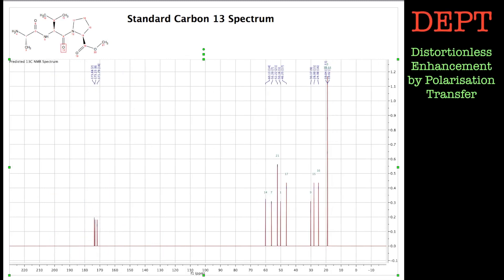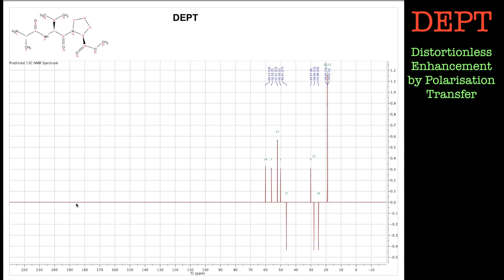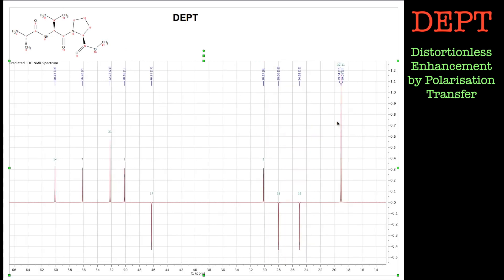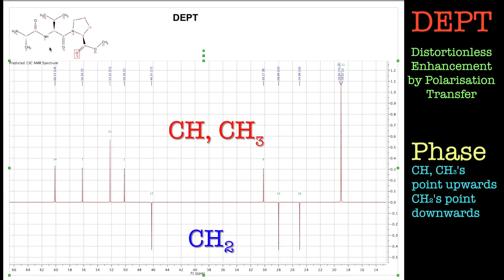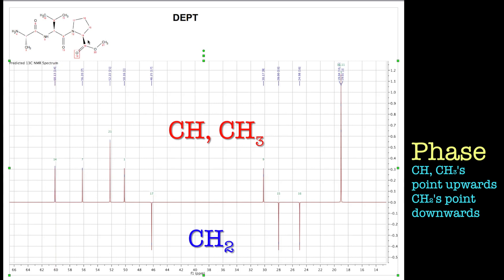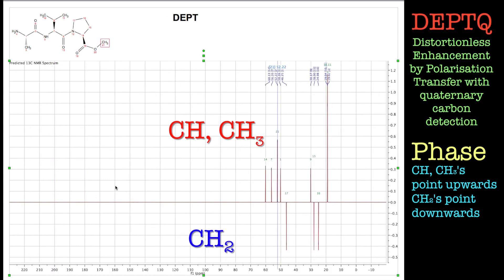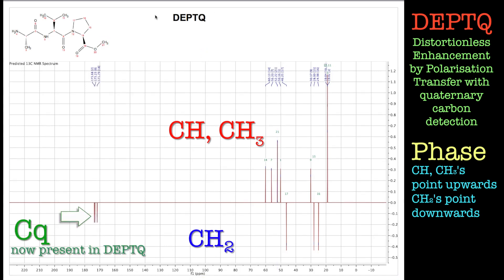DEPT is shown here - it's Distortionless Enhancement by Polarization Transfer. Basically anything attached to a proton will get transferred to the carbon, enhanced, and you'll see it. It looks at the coupling constant between carbon and hydrogen, and in doing that you can add phase to the final spectrum. So the CHs and CH3s are pointing upwards and the CH2s are pointing down. I actually run DEPT-Q, which is like DEPT but with quaternary detection, so you can pick up quaternary carbons as well - a full complement of carbons. That will be projected onto the F1 domain of your 2D spectrum.